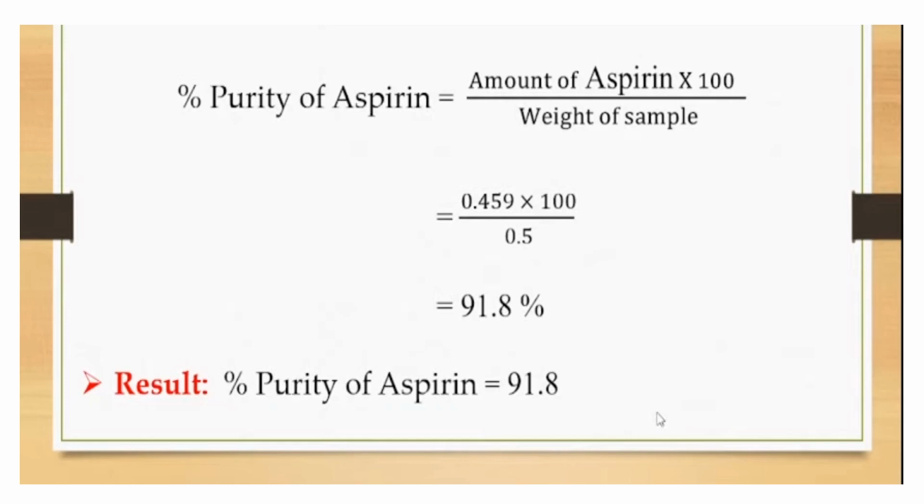For each drug there is a monograph that keeps everything about the drug, from description to how to use it, the bioavailability, as well as the pharmacokinetic profile of the drug. Therefore, you have to check there and identify whether your experiment is error prone or error free.